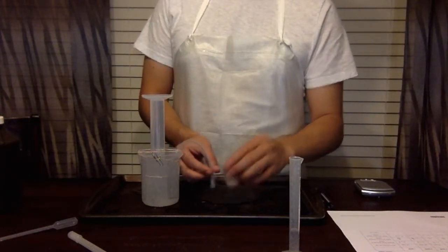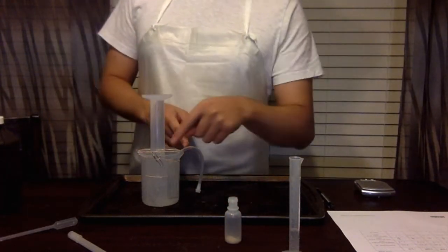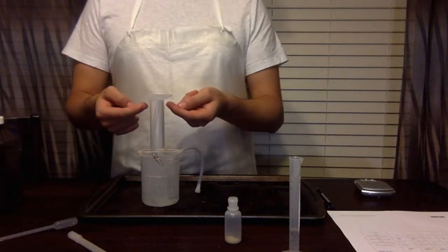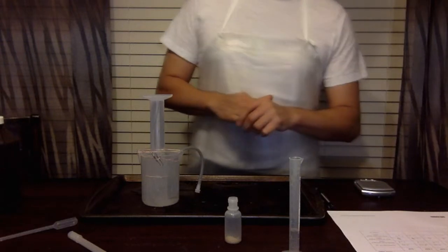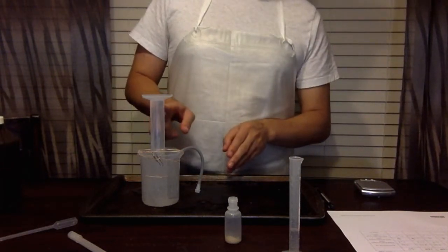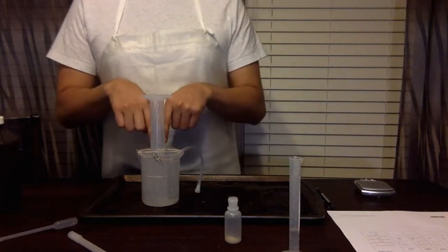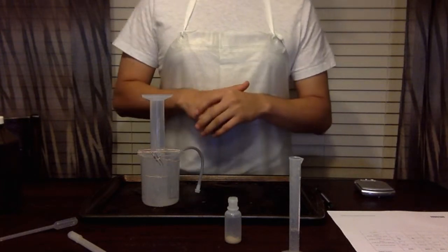reaction has been set in motion, and it's going to create air bubbles that run through the hose and up through the tube. The other end of this hose is right at the edge there, right at the top. So basically, the O2 from the reaction is going to end up in the graduated cylinder, and we're going to measure based on how much water is pushed outward. This is why we're using this 50 milliliter graduated cylinder.